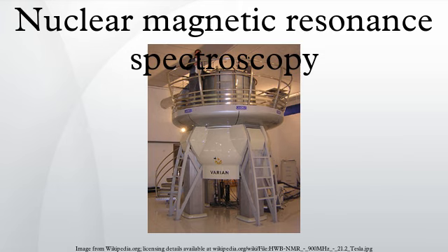Nucleic acid NMR is the use of NMR spectroscopy to obtain information about the structure and dynamics of polynucleic acids, such as DNA or RNA. As of 2003, nearly half of all known RNA structures had been determined by NMR spectroscopy. Nucleic acid and protein NMR spectroscopy are similar but differences exist. Nucleic acids have a smaller percentage of hydrogen atoms, which are the atoms usually observed in NMR spectroscopy, and because nucleic acid double helices are stiff and roughly linear, they do not fold back on themselves to give long-range correlations.